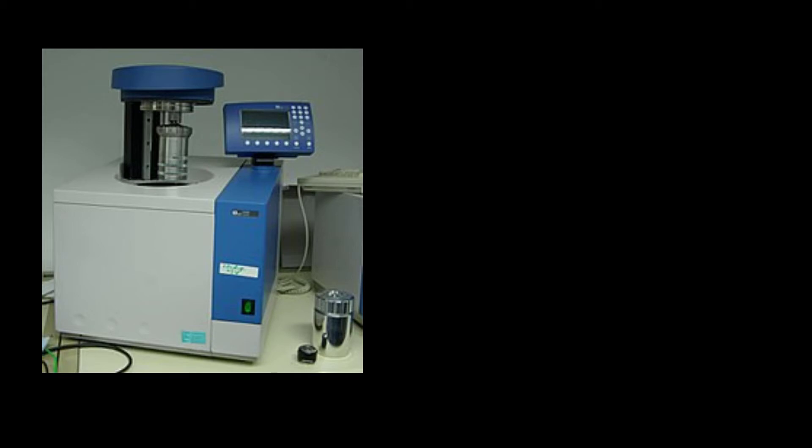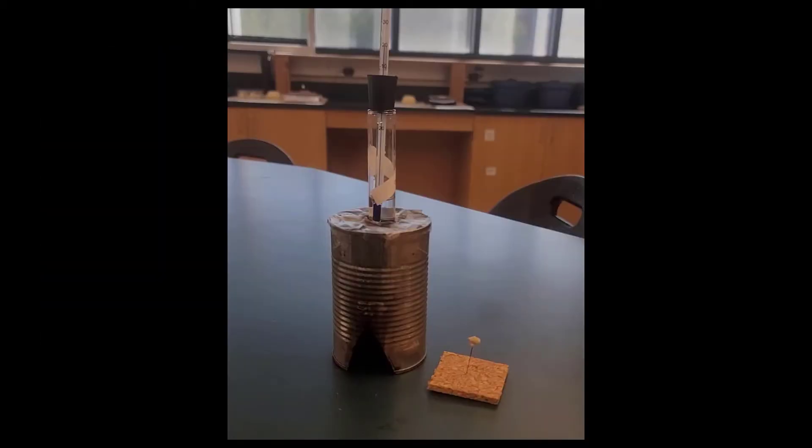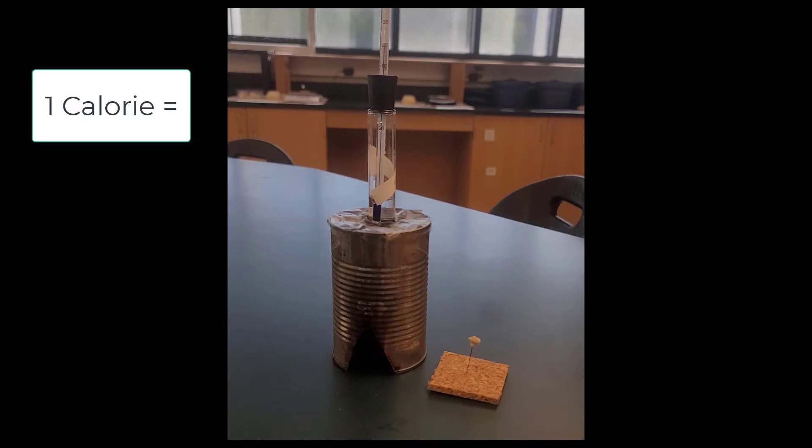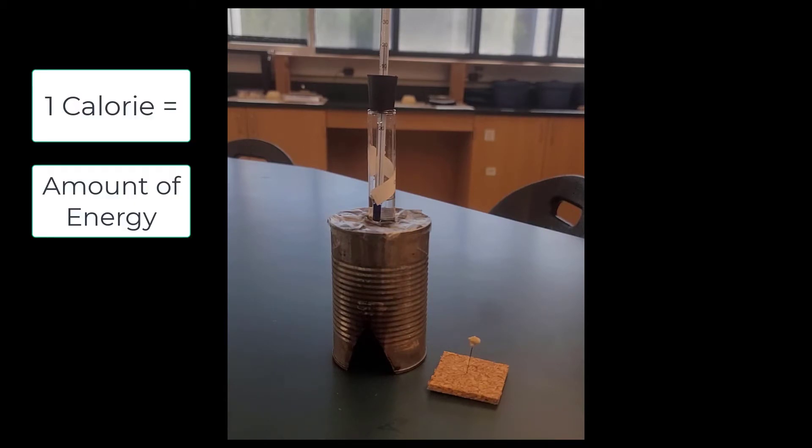The way they do this is by using this device called a calorimeter, which essentially burns up the food and measures how much energy is released when you burn the food. It turns out that a calorie is based on how much energy is required to heat up a known amount of water.